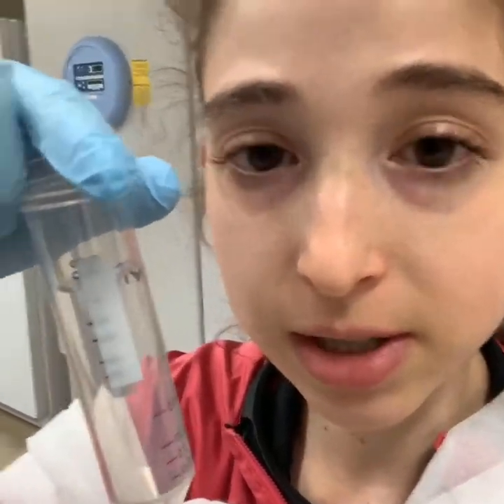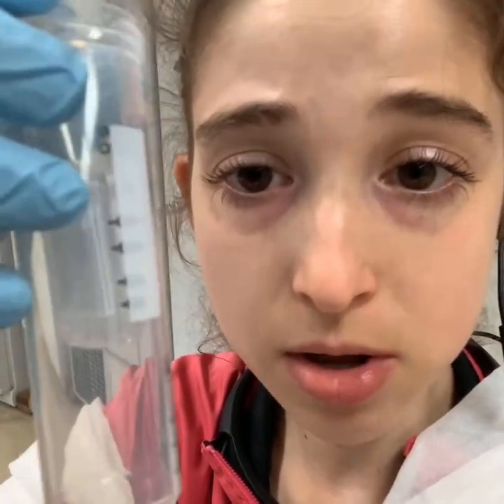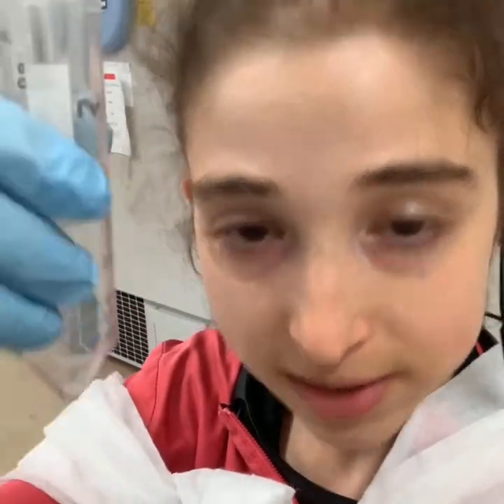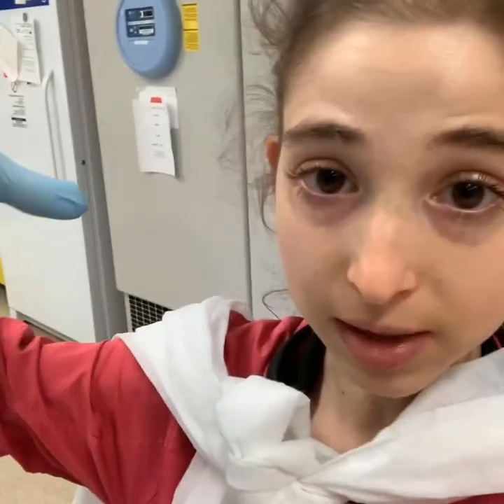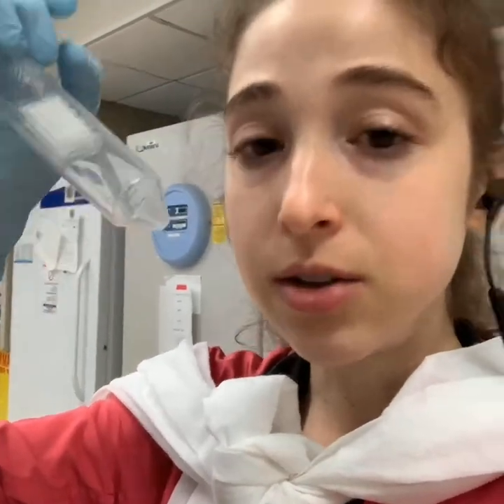You can also do buffer exchange with these, which is a great alternative to dialysis for getting rid of salts, imidazole, or other competitors from your affinity chromatography steps. Because salts are small, they flow through the membrane even though your protein gets stuck. So you can remove the liquid and add new liquid you want your protein to be in — you'll probably need to do that a couple of times to exchange all the buffer out. With dialysis you stick your protein in a membrane pouch in a large liquid bath for hours, then replace and repeat — it takes a lot of buffer and time. So this can be a quicker alternative.